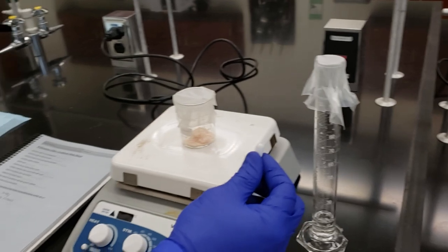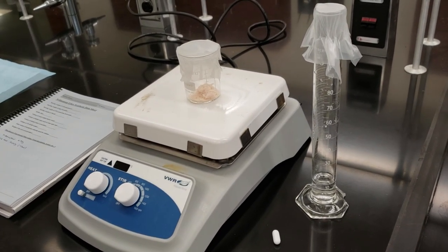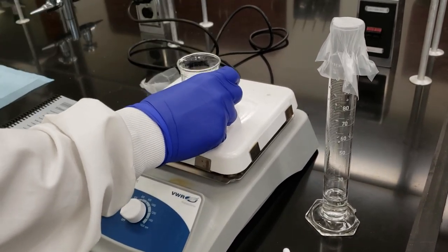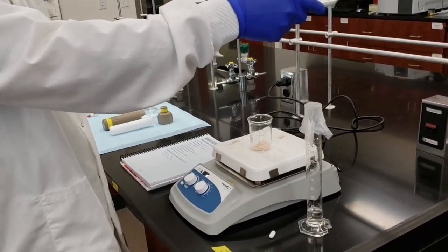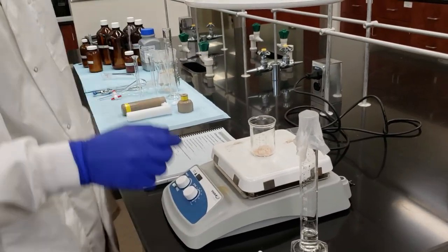We'll put in our stir bar and let them stir and dissolve over the course of several minutes while we get ready to put together our reaction vessel. So I'll go ahead and open up our beaker. I'm going to swivel my snorkel into place. That is a strong odor coming off of our 4-bromophenol, so you want to be very careful.